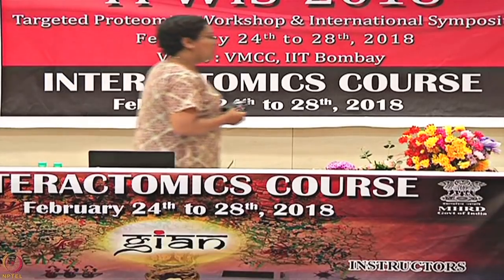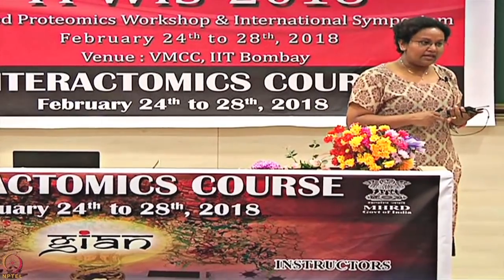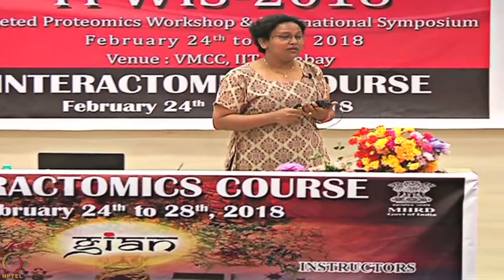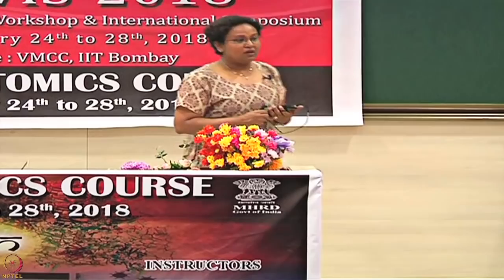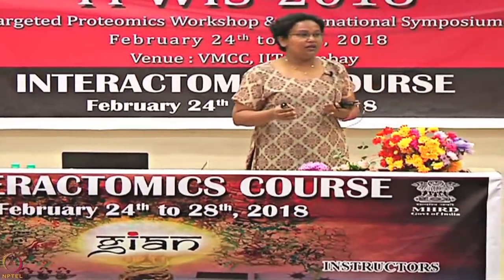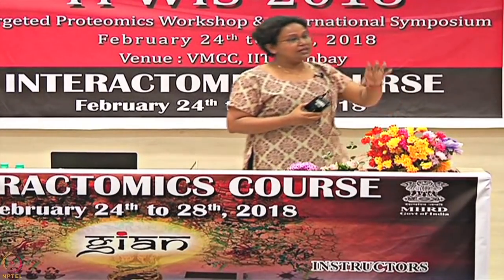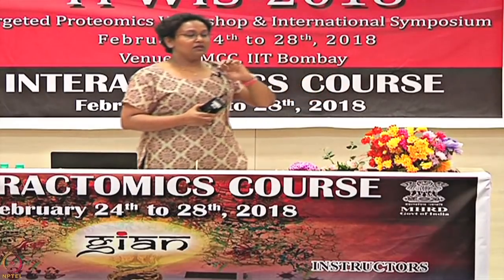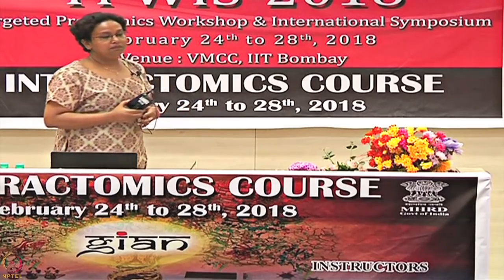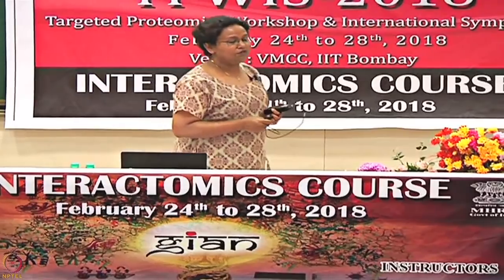So if you're doing a kinetic analysis, even 100 RUs is quite high sometimes. Sometimes you have to go as low as 50, 20, or T200 actually allows you to work as low as 5 RUs Rmax. So you can still get a very decent graph without noise, which we can perfectly evaluate and get a KD value from.